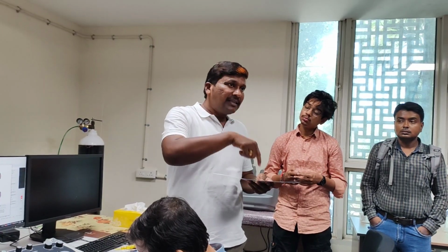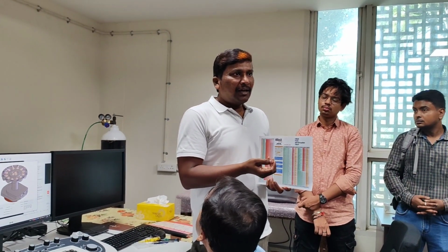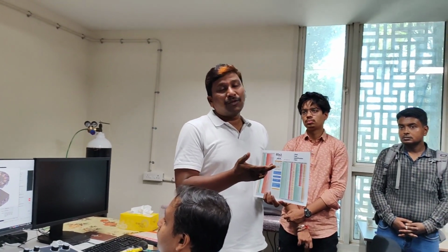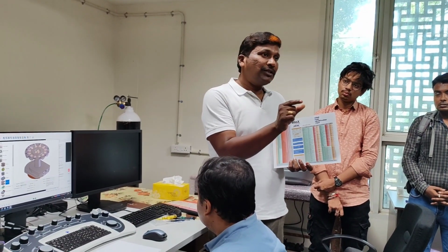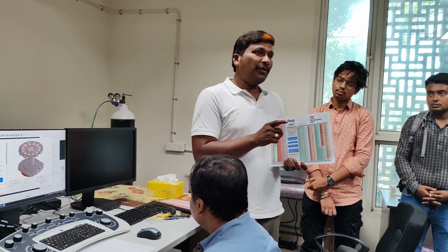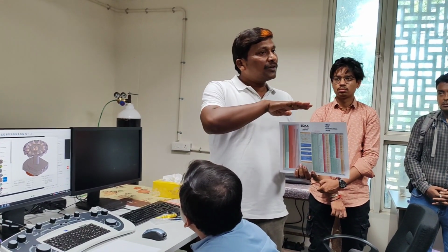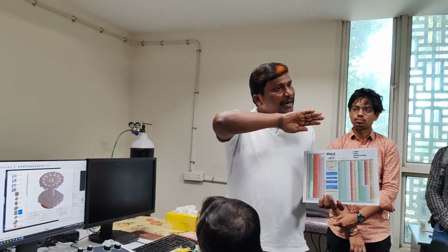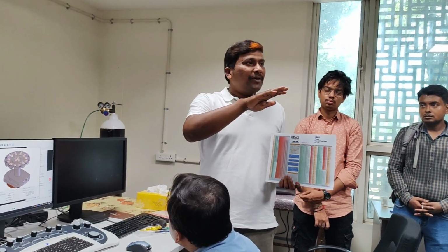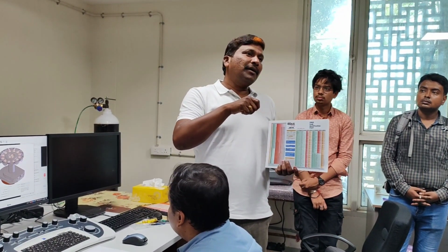If you are later going for indentation and identifying the mechanical properties, that I don't know. But if you prepare on a good conducting substrate or a silicon wafer, quartz is also okay. Most of the time the thin film thickness is on the nano scale, so cross-sectional preparation is very important. Once you coat like this and cut with a diamond cutter, because of the external stress applied during the breakage, your 10 nanometer, 20 nanometer top layers will bend.